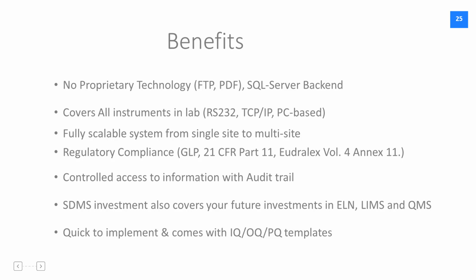The system is fully scalable from a simple startup laboratory, single site laboratory to multi site enterprise laboratories. And the system will help you in regulatory compliance with respect to good laboratory practice, 21 CFR Part 11, EU Annex 11.